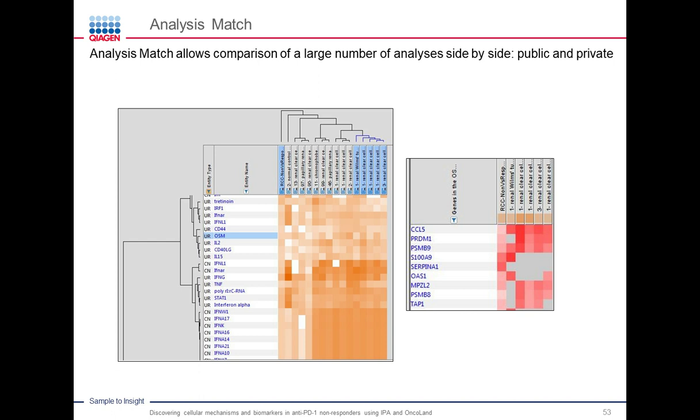Many times people confuse this heat map with a gene expression heat map. So keep in mind, the heat map on the left-hand side, which has orange color, is not a gene expression heat map. In this heat map, what IPA is doing is, based on your gene expression data set, determining what factors and what pathways should be on or off, right? So it determined that OSM should be on, and it has colored it orange. But now you're wondering why OSM is turned on.